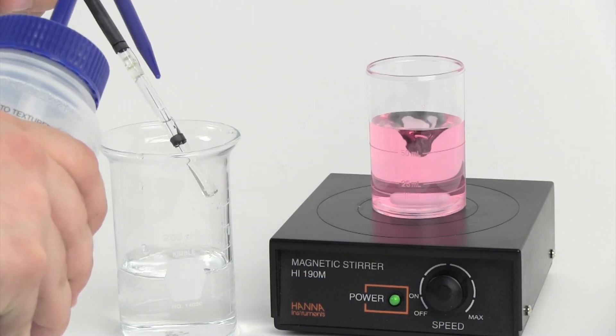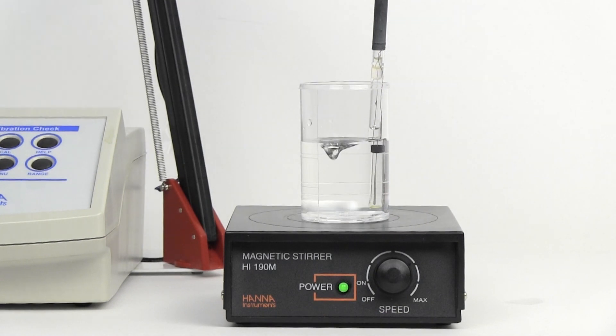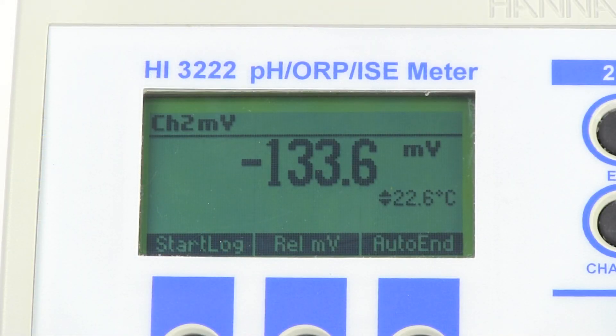Rinse the electrode in deionized water before submerging the electrode in the pH 7 buffer. Once again, wait for the reading to stabilize and record the millivolt value.